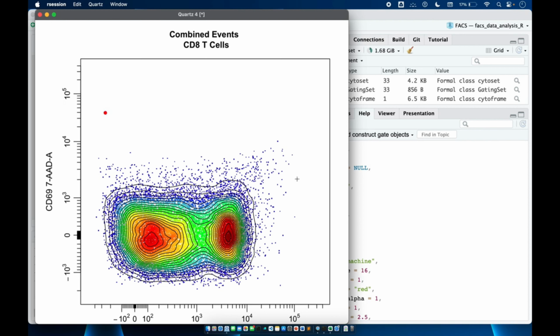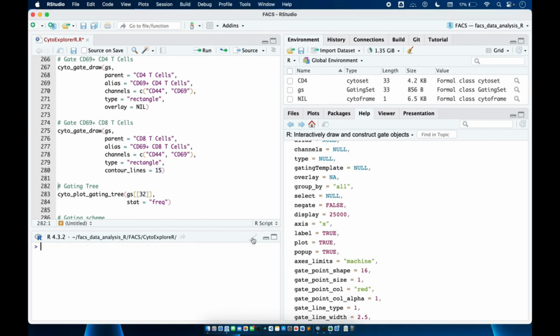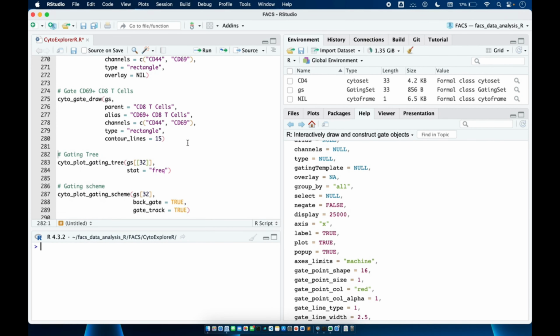So you click here or over here, so it's around 1.15%. Again, these values are not accurate. It totally depends on your experiment, you know it better.